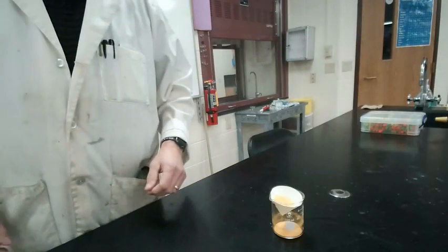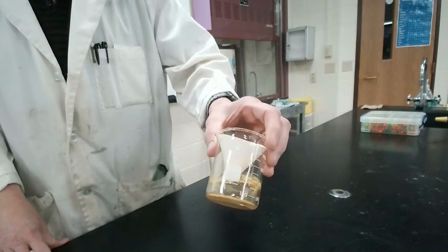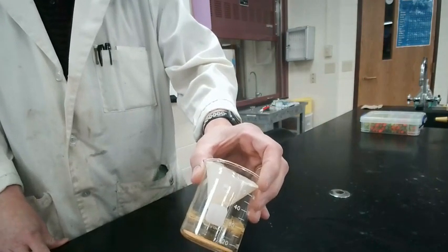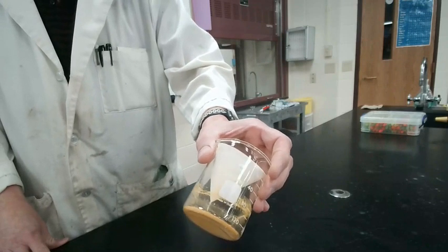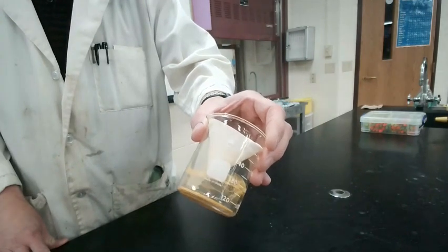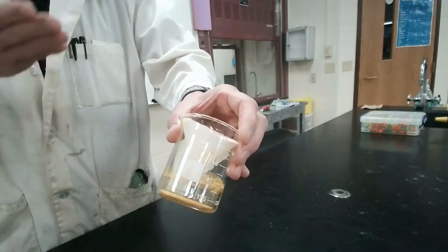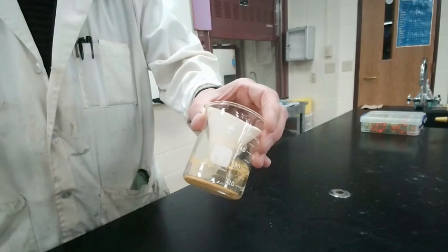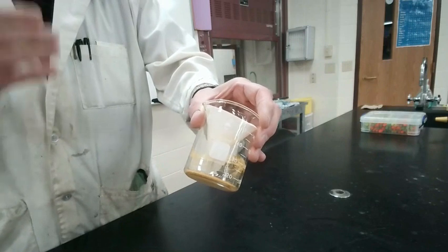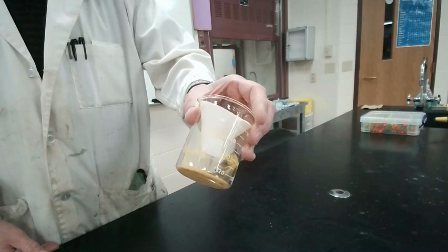All right, ladies and gentlemen, it's now the next day. I've taken the sample out of the drying oven. You can see that it is completely dry. The filter paper is dry. So now we're going to take and find the mass of this, and that is the mass of the precipitate. Now the important thing in this calculation is I only want the mass of the precipitate. So yesterday we took the mass of the beaker empty. We took the mass of the filter paper. We now are going to get the mass of everything together. So then we're going to have to subtract the mass of the beaker and the mass of the filter paper to find just the mass of the solid substance.